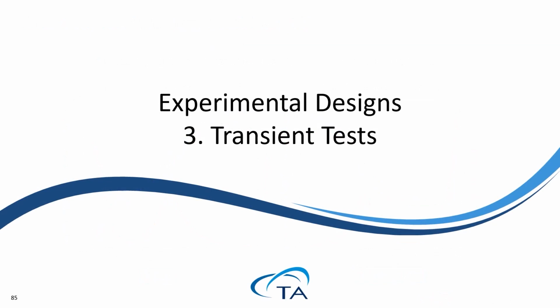So far, we have introduced all of the commonly used oscillatory test methods to evaluate the viscoelastic property of a material. In this last section, we would like to introduce two commonly used transient test methods, which are the stress relaxation and creep recovery tests.